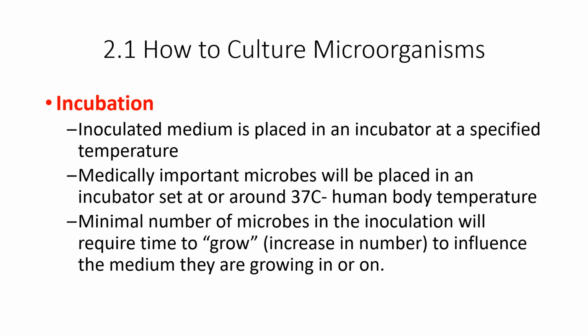Once you've inoculated, you've taken the microbes, the bacteria, and introduced them to the media, the agar or the broth, you now have to incubate. It's going to take time. Because when you inoculate, you're only transferring over a few bacteria, a couple of dozen, maybe a few hundred at most.